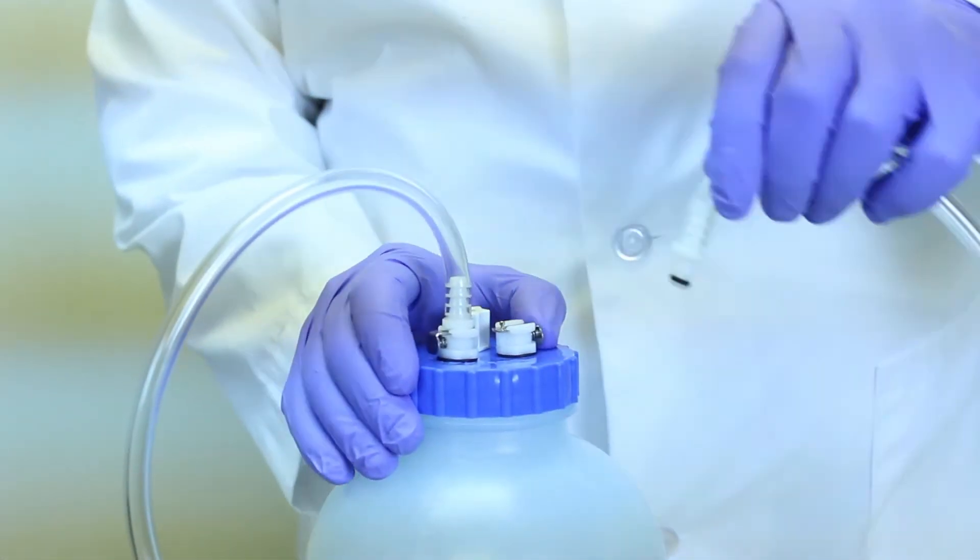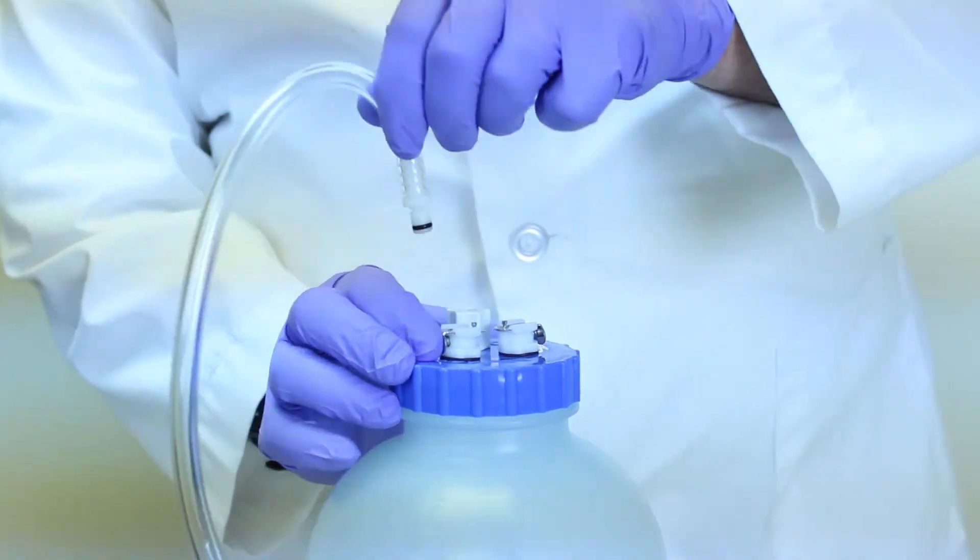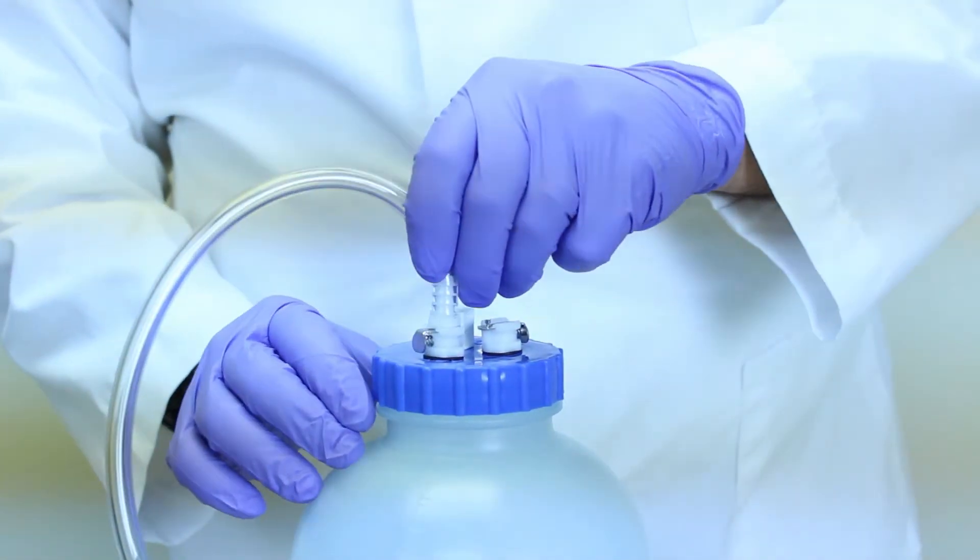Quick disconnects on the high-flow model allow for easy removal, emptying, and replacement of the heavy wall bottle.